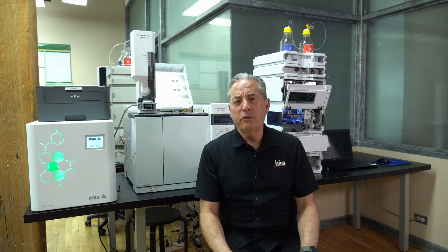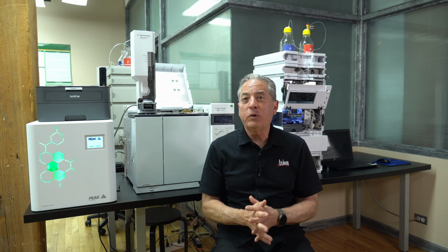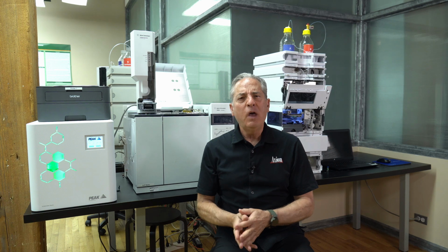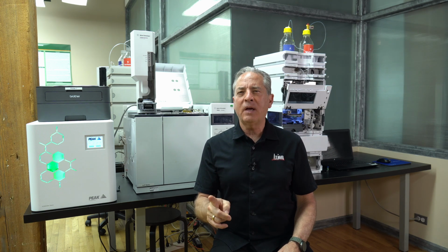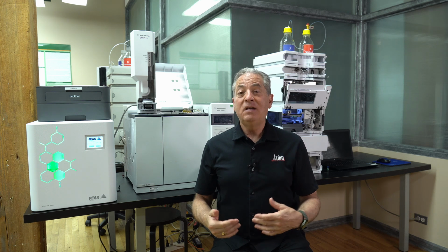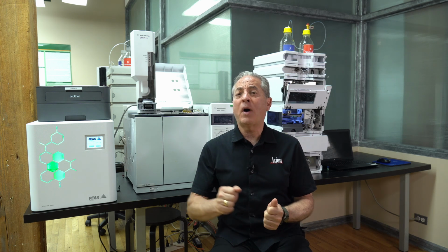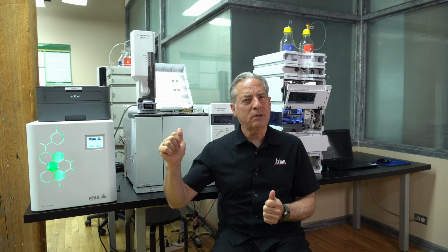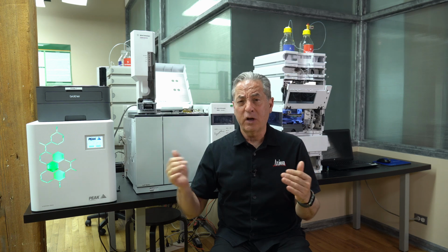So one easy question for the interviewer to ask you is, when you're doing GC, what's the difference between isothermal and temperature program? Well, isothermal, by definition, means one temperature. We're running one column temperature throughout the entire run. Temperature programming means we're going to start at a low temperature and we're going to program to a higher temperature. We always go up in temperature, we never go down. So we give it initial temperature, we give it a rate of, let's say, 20 degrees a minute, and a final temperature.